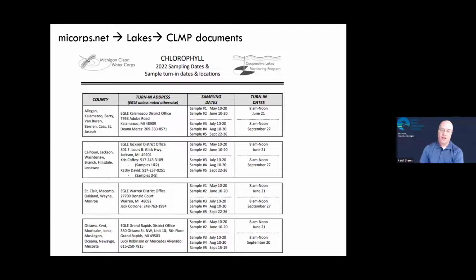So if you make a mistake in your samples 1 and 2, we can see that and make sure to communicate those mistakes to you prior to you taking samples 3, 4, and 5. So then maybe you've only messed up 2 samples instead of all 5 of them. So that kind of is the reasoning for why we do this particular schedule.